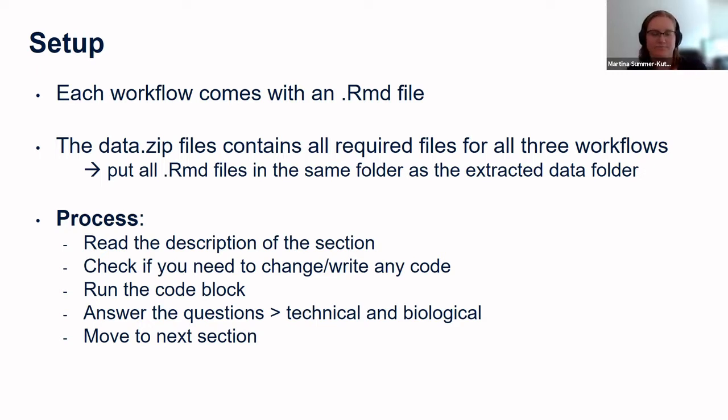And what you then will do is you open this RMD file in RStudio, and for each section you have a description of what the section is about. Then some code blocks will need you to change or write some code. You can check that, and some you might just need to run. And then there are questions below the code block. Those might be technical or biological. And you can answer them.